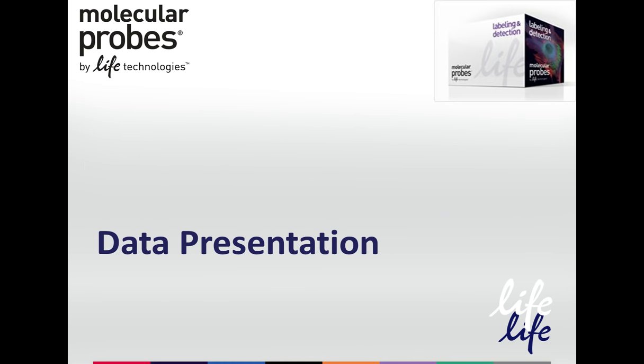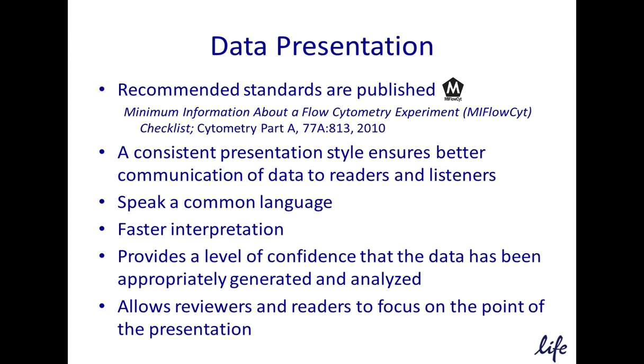So we'll finish up by discussing guidelines for data presentation. There are recommended standards which are published on best practices for presentation of flow cytometry data. These recommendations help a consistent presentation style and ensure consistent communication of data to readers and listeners. It uses a common language and allows for faster interpretation. It helps provide a level of confidence that the data has been appropriately generated and analyzed. And it allows reviewers and readers to focus on the point of the presentation.